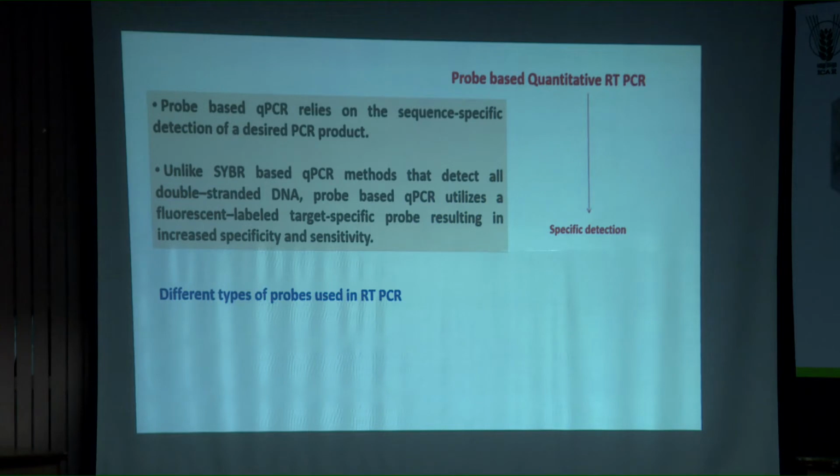Put it in very simple language, you are putting two primers there. We don't call both of them primers. One is the typical primer because it primes the polymerase reaction. Another one is similar to a primer, but it is called a probe. What it does, it will go and bind to the target. I'll take one example. If you want to amplify a gene, let us say flaC in a bacteria, or ITS in fungi, or TEF in fungi, you design two primers. One you call a primer only, another one you will call a probe. Why?